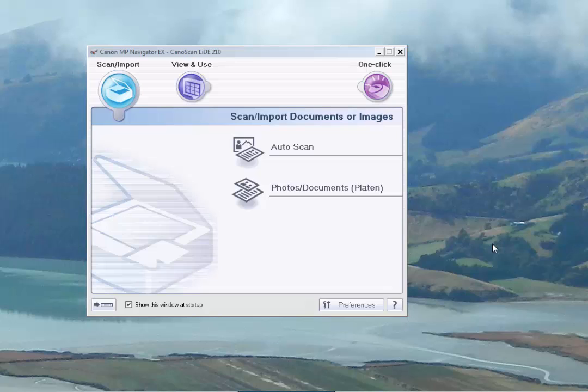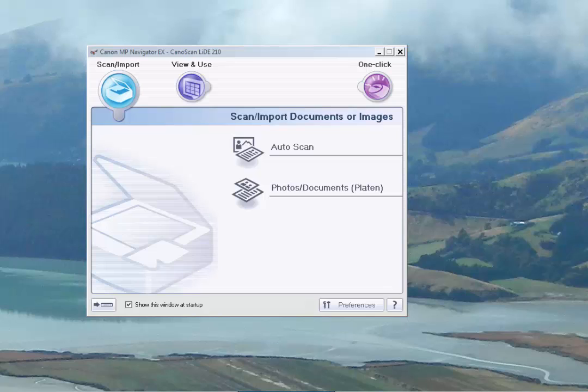We're going to start going through the setup of the software for the Canon LIDE 210. The software that we're using here is the Canon MP Navigator version 4.0. Follow the instructions that come with the scanner and install the software before getting started with this tutorial. You'll get that by clicking on your start menu, going to all programs, looking up Canon utilities.